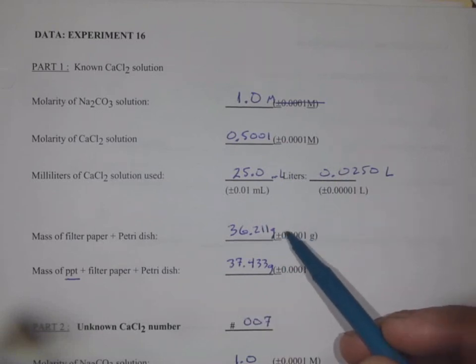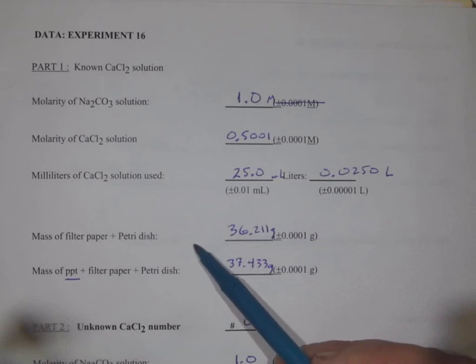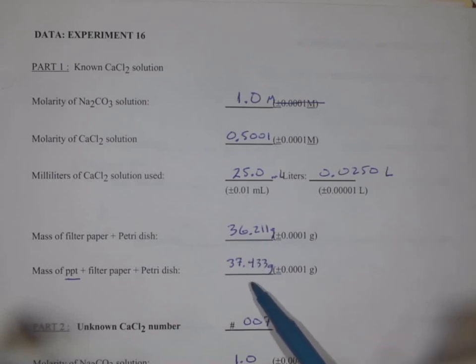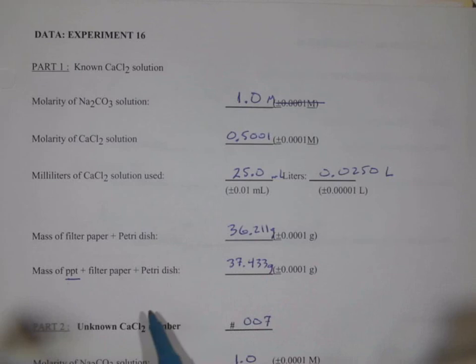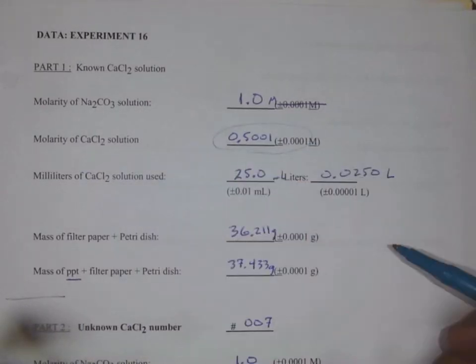And then after we've done the experiment, we found that the filter paper and the petri dish before we used them were 36.211 grams. Once we've collected and dried the calcium carbonate product, the combined mass, now including that precipitate, is 37.433 grams. Okay, so that's our part one. This is our known solution. We knew this one going in. We're seeing how well the experiment worked.